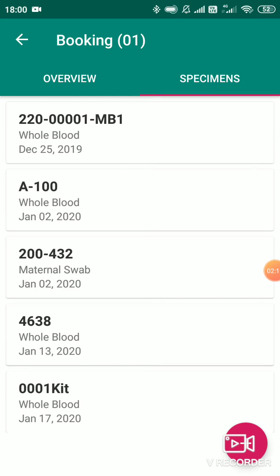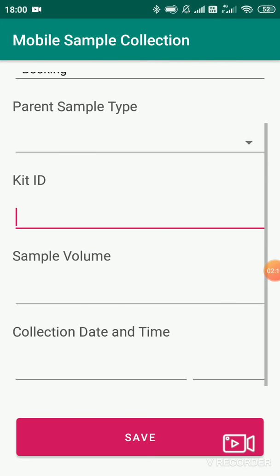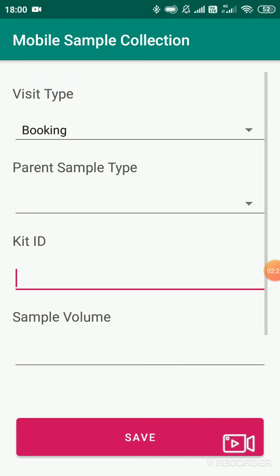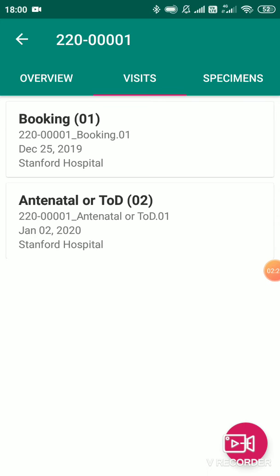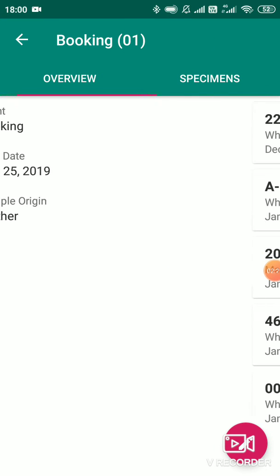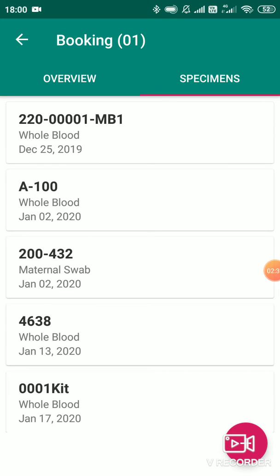These are the existing specimen data entries that I have already done. You can click on the plus sign, enter the data for specimens, and click save so that the specimen collection will be completed. Remember that you have to click on the visit and then swipe right to make the specimen collection — otherwise you can only view specimens, not add or edit them.